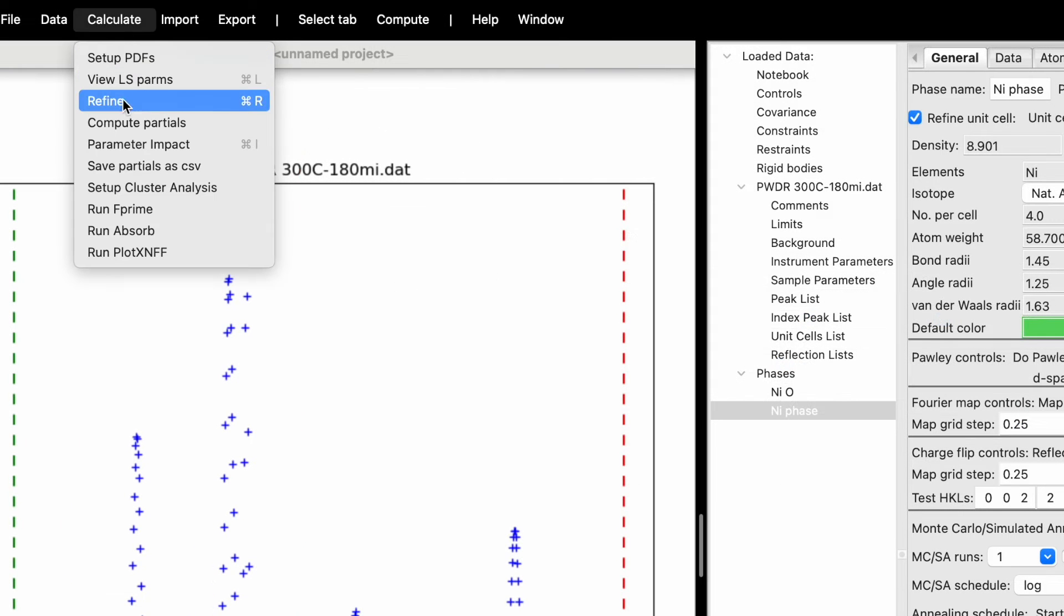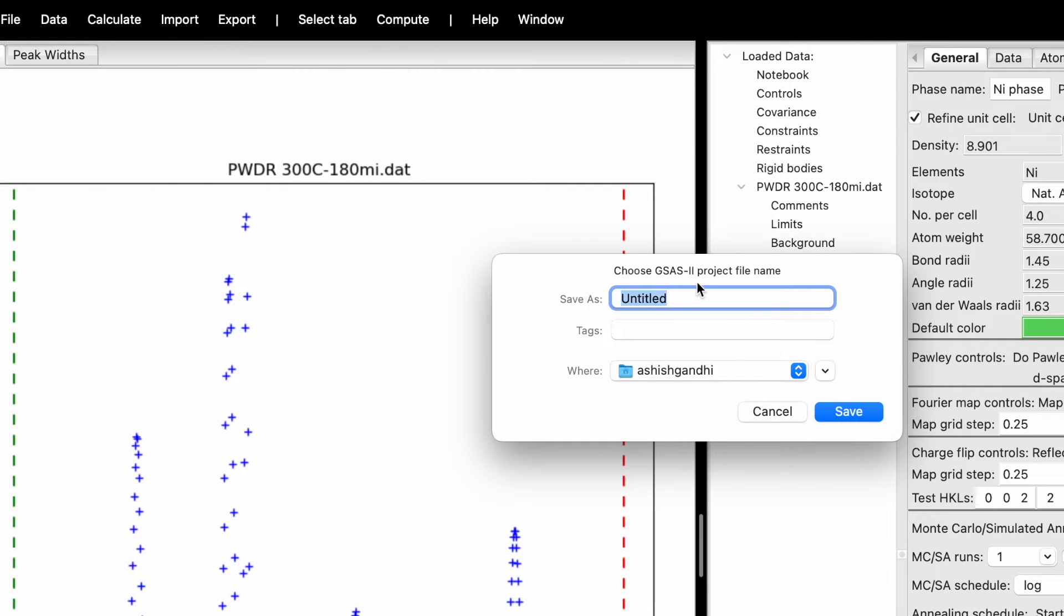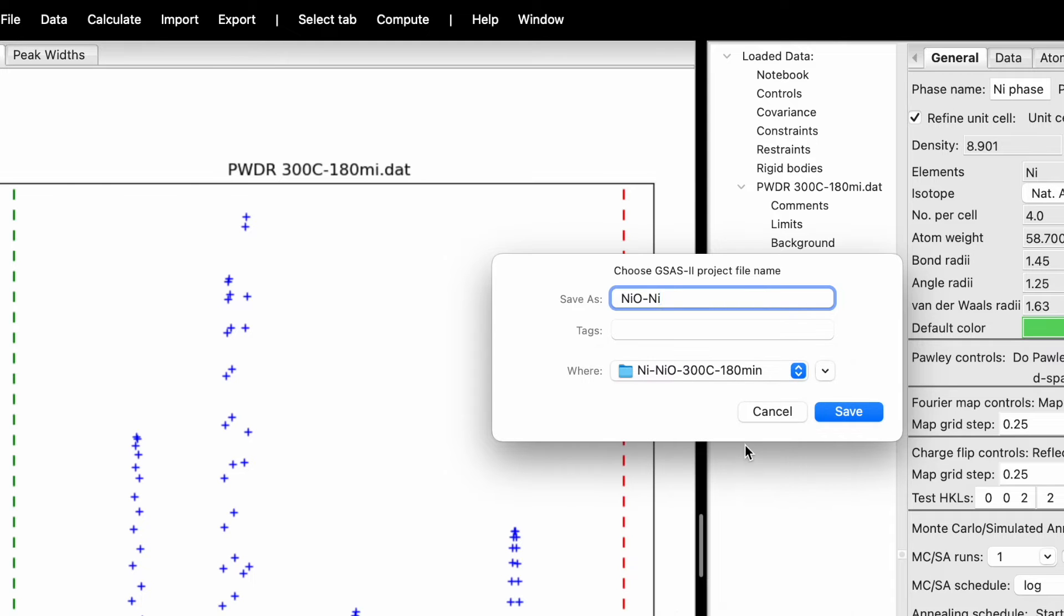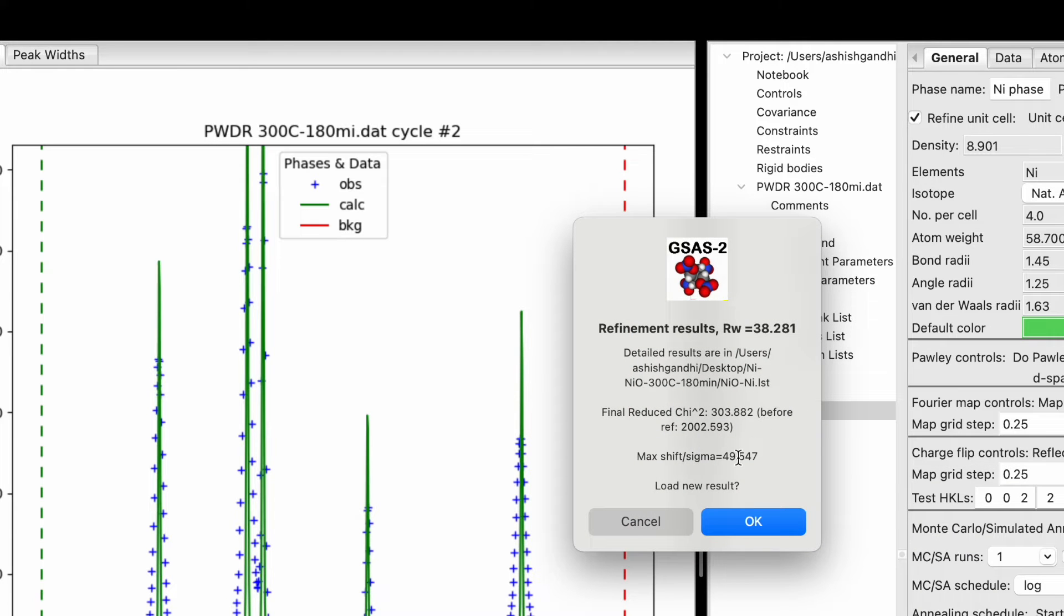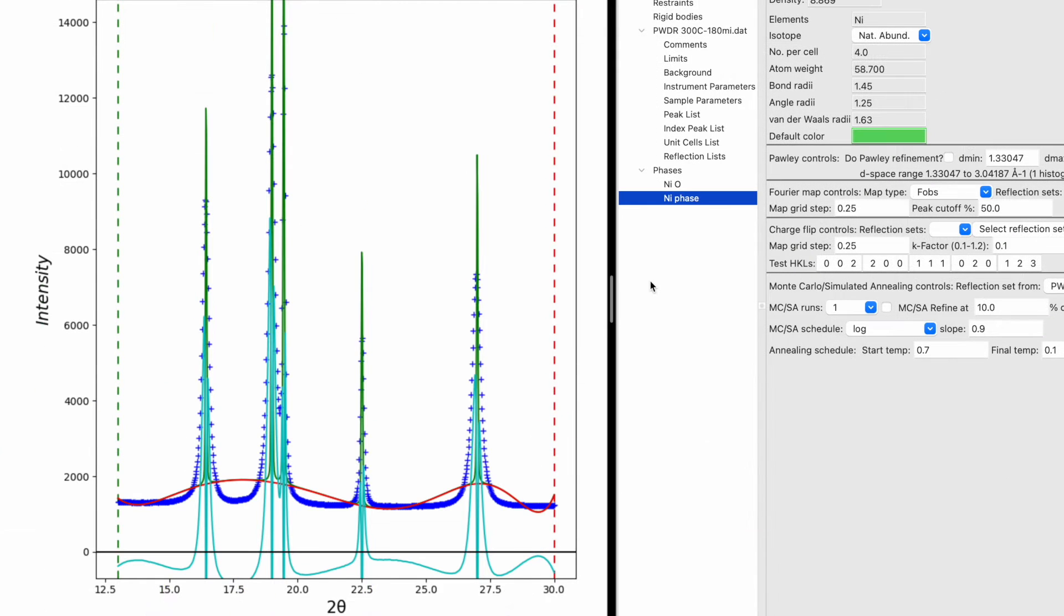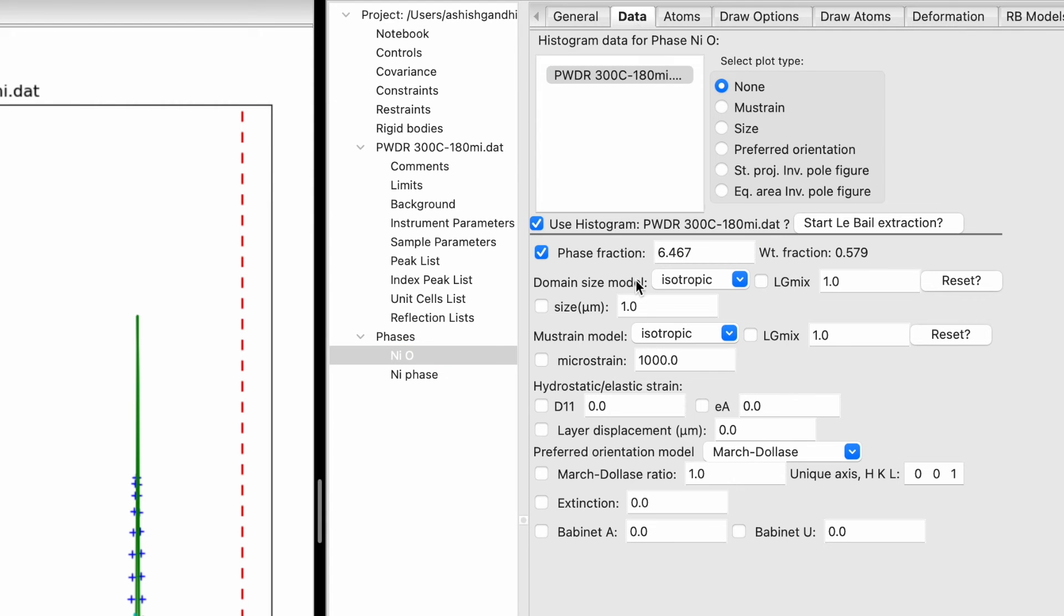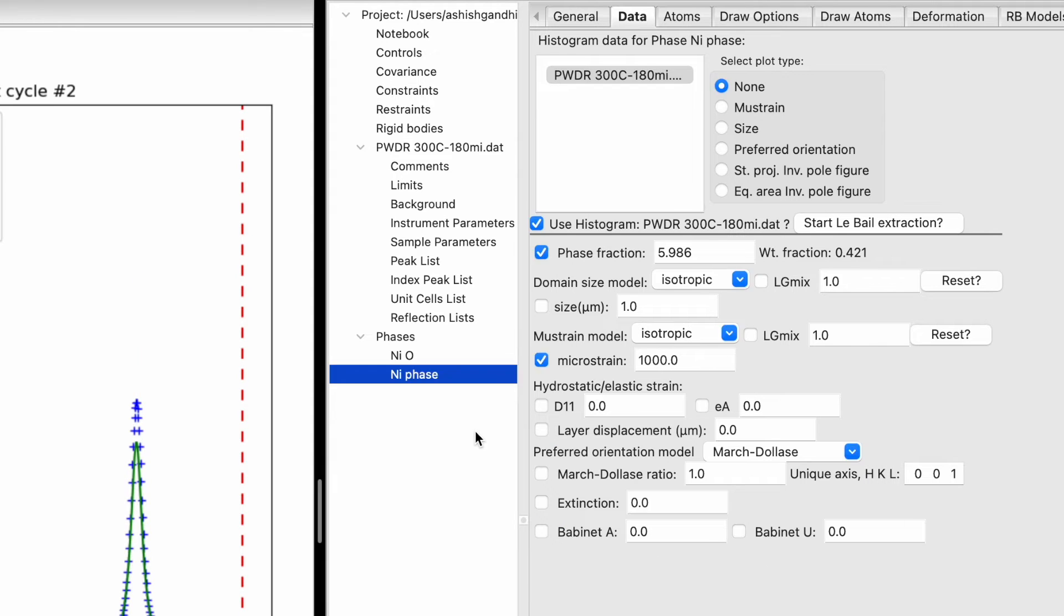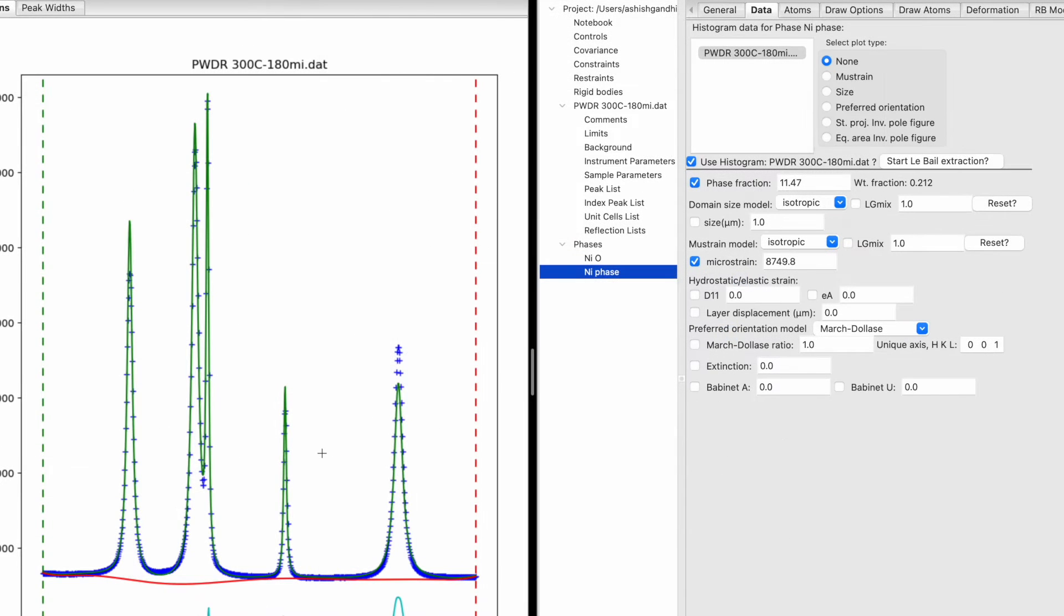Click on Calculate, then Refine (shortcut Command+R on Mac or Control+R on Windows). Choose the GSAS-II project file name and save location. The initial reduced chi-square is 303. The XRD peaks look much broader compared to the calculated peaks due to microstrain or size factors. Check the microstrain boxes and hit the refinement button. The chi-square improved to 6, and the fitting looks much better.